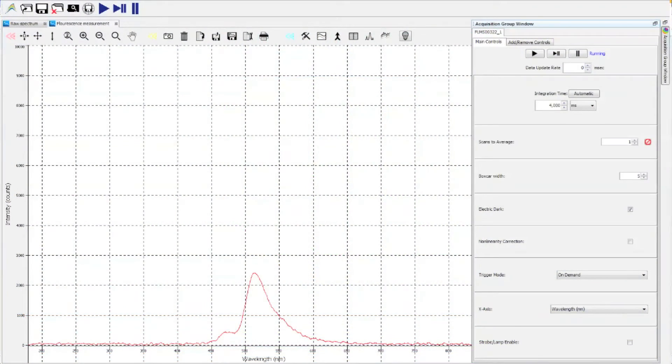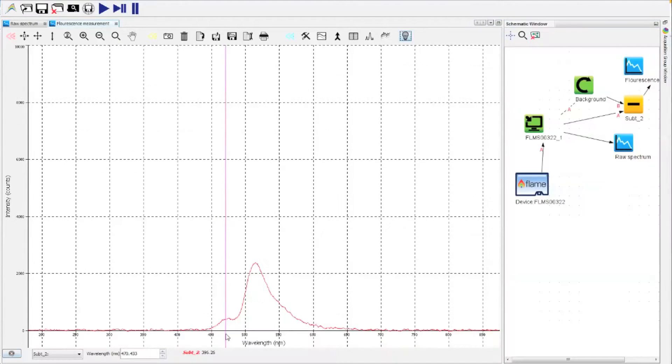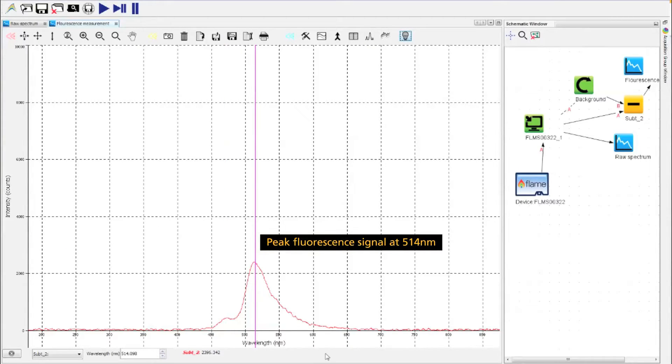Other considerations include keeping the wavelength of your light source distant enough from the peak emission wavelength where you're expecting to see the most fluorescence from your sample. You don't want the two wavelengths to overlap too closely, as it can make it difficult to see your fluorescence signal.